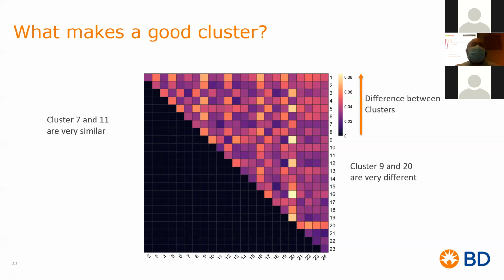Let's say you had an expression level of 1,000 of CD3, and you had another group of cells that had 990. Bioinformatically, they're different by a figure of 10, right? Biologically, does that matter? No, because you're 990 and 1,000. If I was going to create a gate, I'm going to gate them all together.